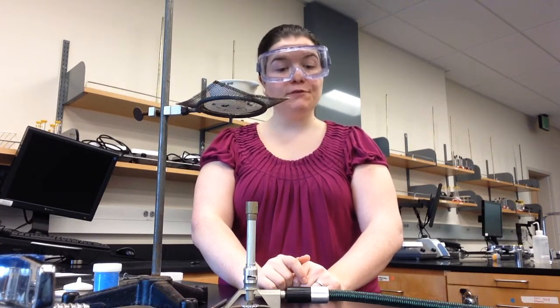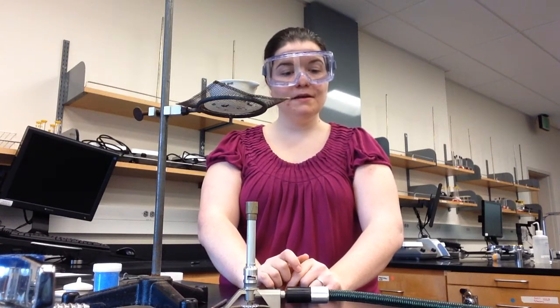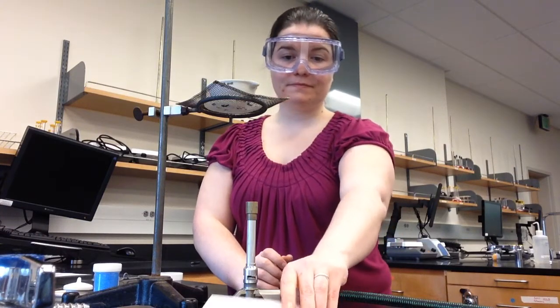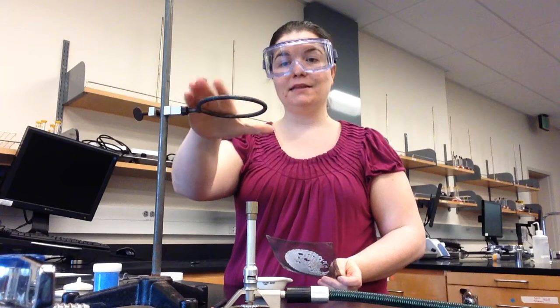If time allows, you can repeat any part of this experiment that you wish to collect more data. You will then dispose of the waste in the correct labeled containers in the fume hood. Return any borrowed items, like the wire gauze, the ring stand, the ring clamp, and the Bunsen burner, to the appropriate places, whether it's a shelf, a drawer, or the lab cart. Wipe off your lab bench, remove your goggles, lock your drawer, wash your hands, and leave lab.